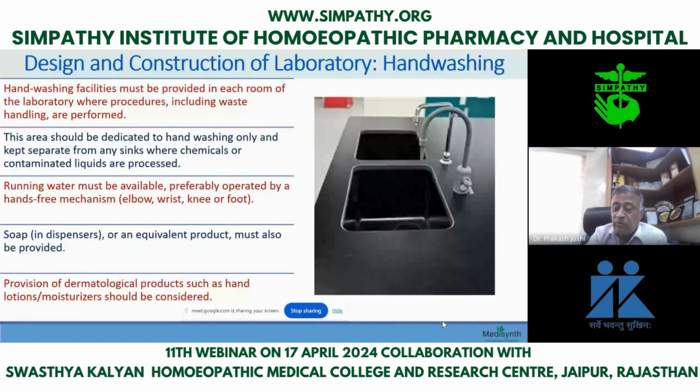For purified water, the monograph is there in the pharmacopoeia in the 8th or 9th volume. You can see that there is conductivity, total solids, and everything mentioned in that. And it should be free from E. coli, Salmonella, Pseudomonas, and Staphylococcus. So purified water is always used for any test. For washing, you need potable water. But if you want to do any test, or if you want to dilute strong alcohol to dispensing alcohol, then the water to be used is purified water.